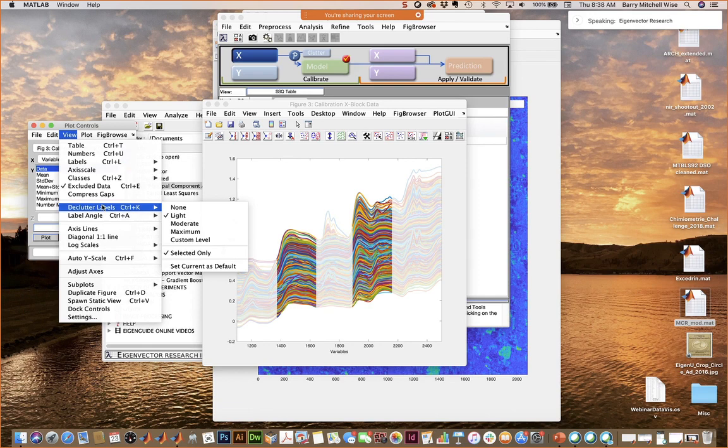It doesn't handle the labels very well in terms of memory management and speed management. So it's really useful to only include the ones you want. That was why I showed you that trick about just selecting what samples or what channels maybe that you want labels on, and then putting them just on those, because that really speeds things up a lot.